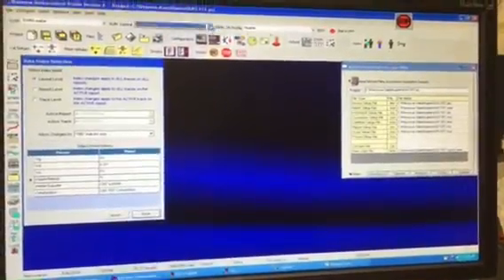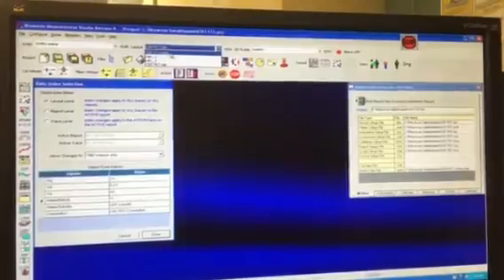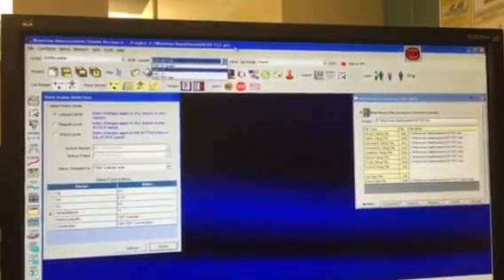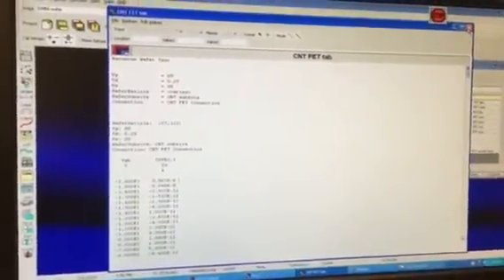Oh, okay. So both the tablet and the layout can be switched from here. You don't have to go back in and set them up. This one probably has quite a bit of data, but it's all on top of each other. If you want it to be all in columns, this is where you would go back to the tabular report setup.